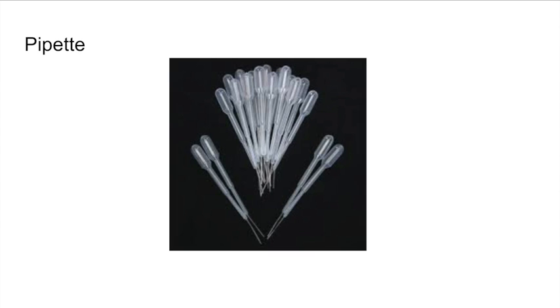The pipette is a more controlled and precise version of the dropper, as it has a much narrower end. The pipette is used for transporting a measured volume of liquid, and it enables sterile and accurate liquid handling, which is most commonly used within molecular biology, analytical chemistry, and medical tests. Most disposable pipettes hold around 5 milliliters of liquid.